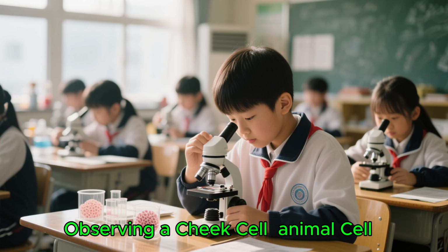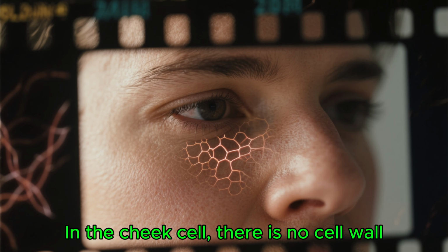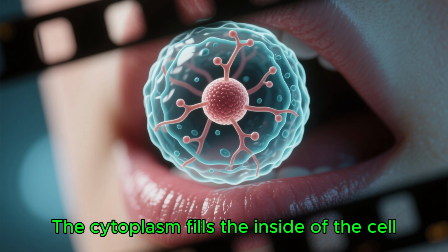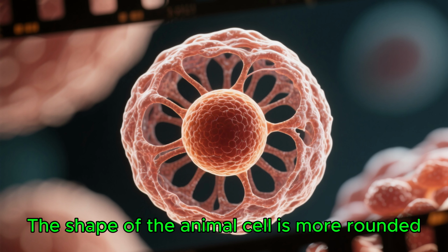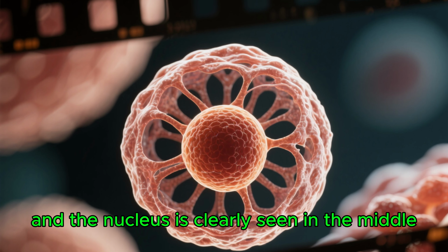Observing a cheek cell, an animal cell: in the cheek cell, there is no cell wall. We see only the cell membrane on the outside. The cytoplasm fills the inside of the cell, and the nucleus can be seen near the center. The shape of the animal cell is more rounded, and the nucleus is clearly seen in the middle.